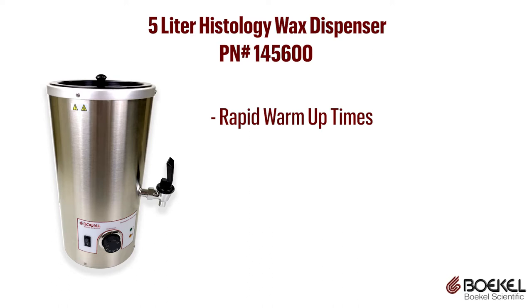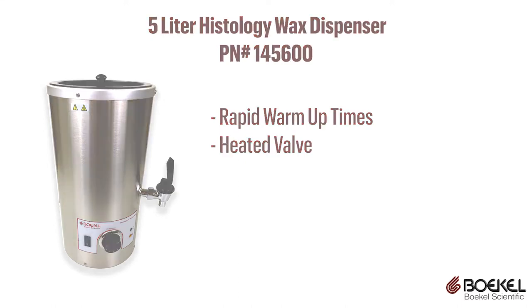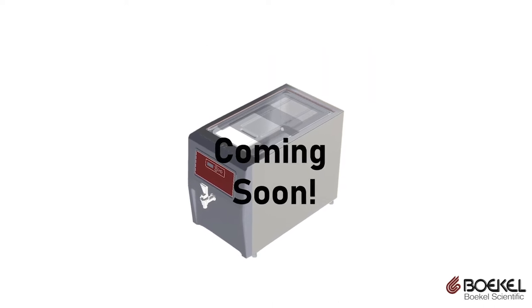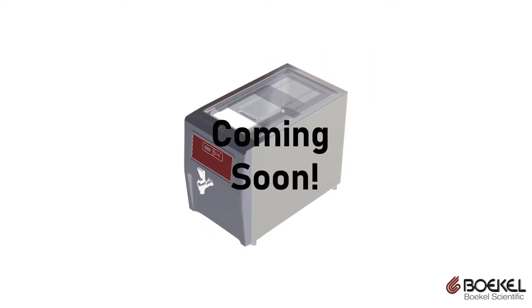The unit has rapid warm-up times and a heated valve to ensure a consistent flow of molten wax for your samples. Due to customer feedback for a larger wax dispensing system, Bocal Scientific will be launching in the fourth quarter of 2020 a digitally controlled 28-liter wax dispenser.